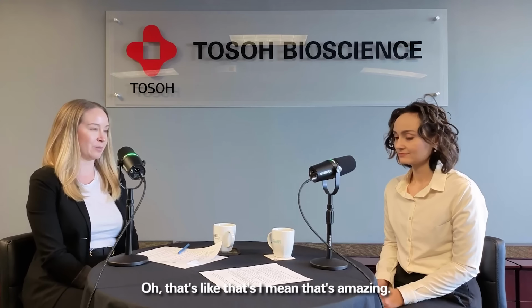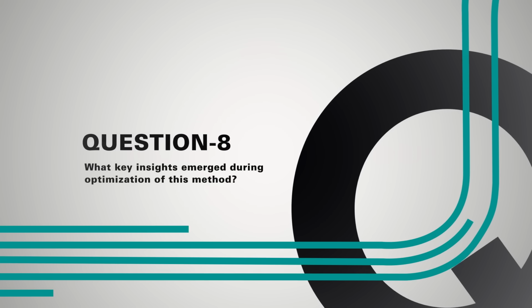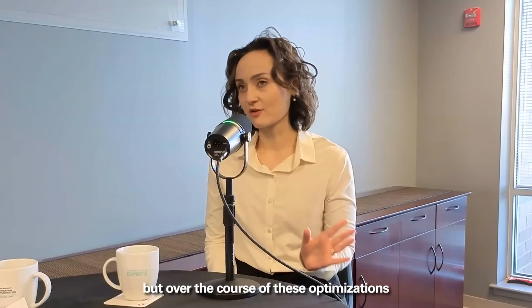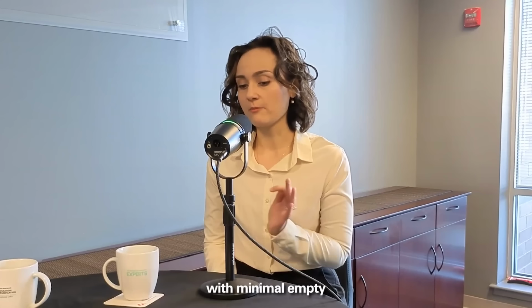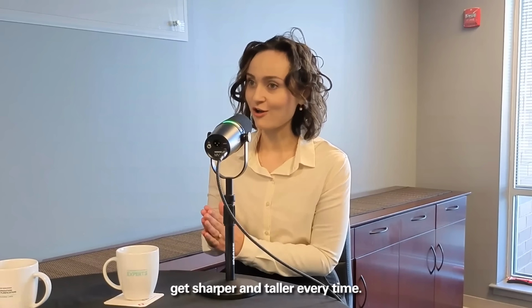Oh, I mean, that's amazing. So during your research, when you were optimizing this method, were there any light bulb moments where you realized, oh my gosh, we made a breakthrough here with this purification? I wouldn't say there was a particular moment, but over the course of these optimizations that I spent a long time doing, getting greater resolution with minimal empty capsid contamination in the full peak was pretty gratifying. Seeing the peak get sharper and taller every time, that was pretty cool. No, that's awesome.